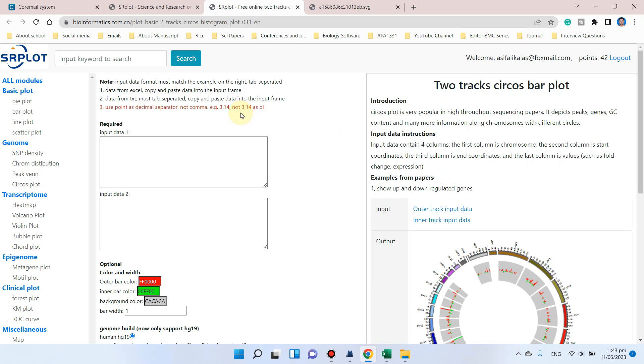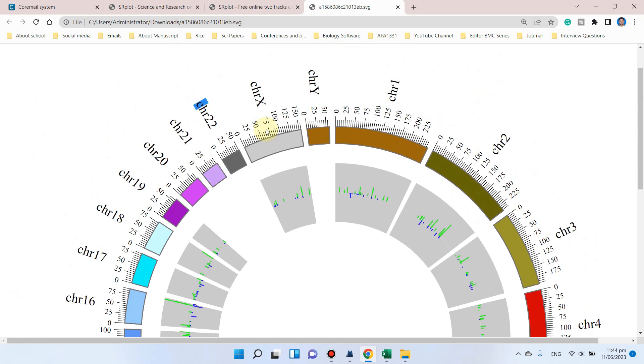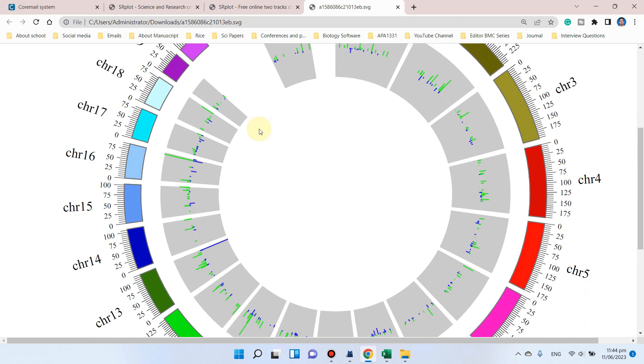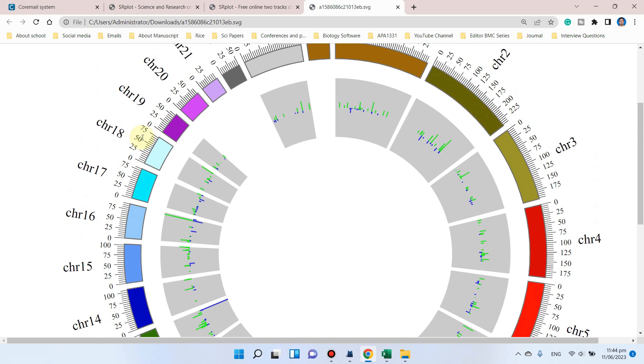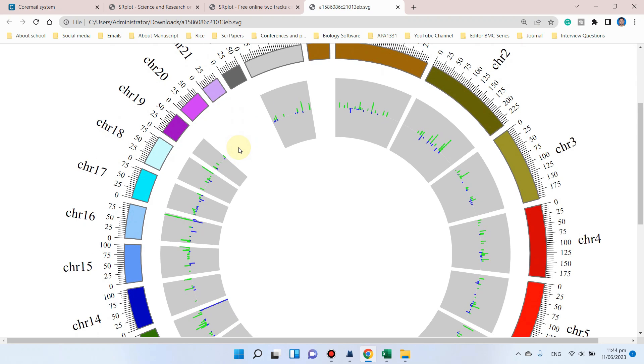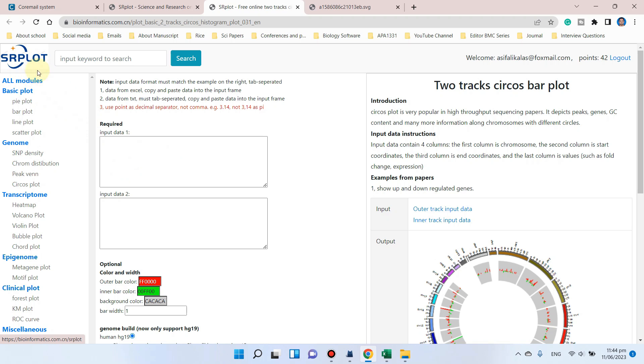Welcome to another video tutorial. In this video, I will show you how we can use the SR Plot website to draw two-track circus bar plots. Circle plots are two-dimensional representations that show relationships between positions or objects, and this figure is commonly used in genomics. I will show you how we can draw these circle plots and prepare the files for drawing without any coding.